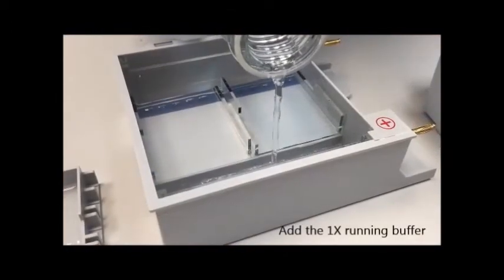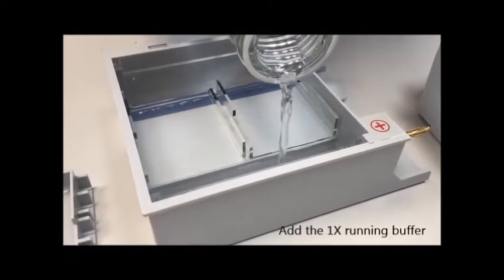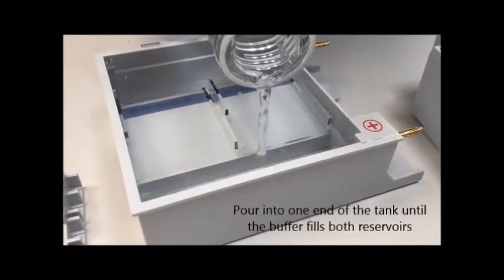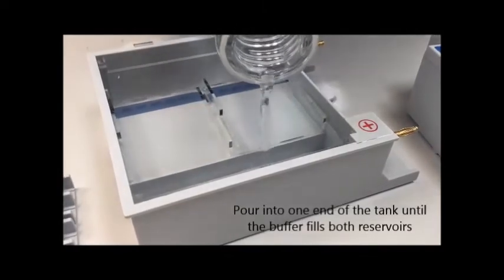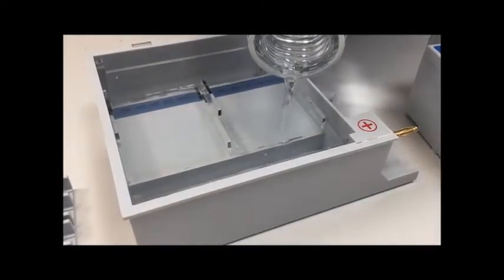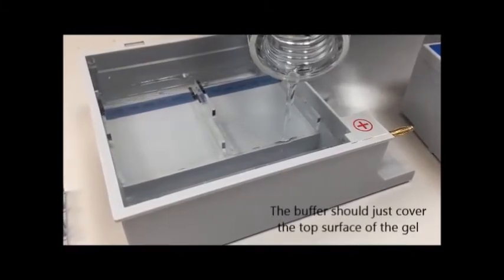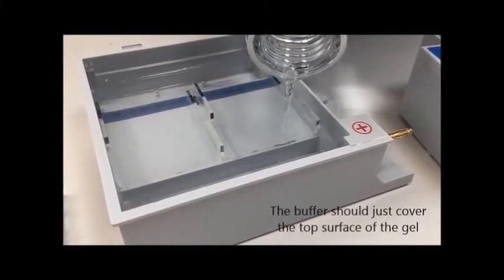Next, add the 1x buffer to the running tank. Slowly pour the buffer into one end of the tank until the buffer fills both reservoirs. There is enough buffer in the tank when both reservoirs are filled and there is a small amount of buffer covering the gel.